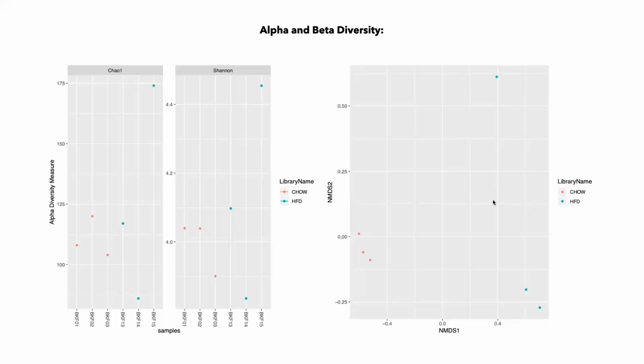Of course, here we have a very simple characteristic, just color, but if there were thousands or maybe hundreds of these characteristics, now you get a harder problem to separate them by diversity. So that is what NMDS is for. Okay, any other questions about what this analysis actually does and how it shows us the microbiome? How does it help us characterize the microbiome?